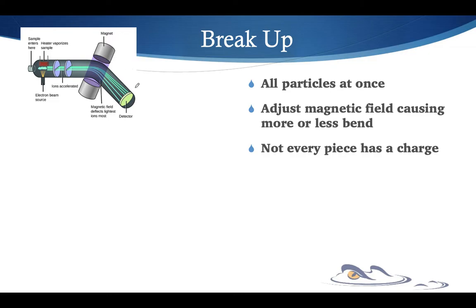And if they do that, let me try to draw a blow up of this area here, trying to draw the tube as it bends. So here's the tube bending. As a particle comes down here, if it's too heavy, then the magnetic field just doesn't cause it to bend enough, and it will hit the side of the tube that it's going down.